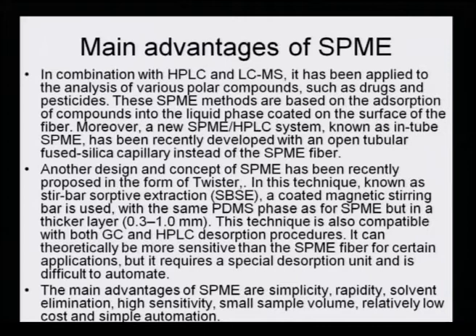This technique is also compatible with both GC and HPLC desorption procedures. It can theoretically be more sensitive than the SPME fiber for certain applications, but it requires a special desorption unit and is difficult to automate.